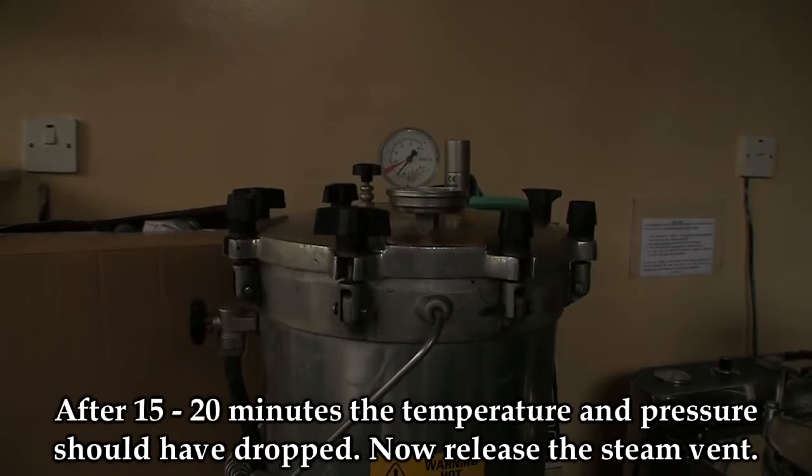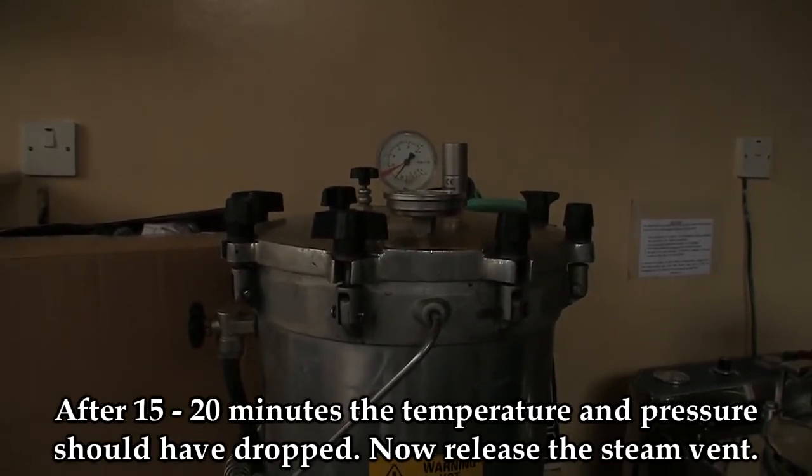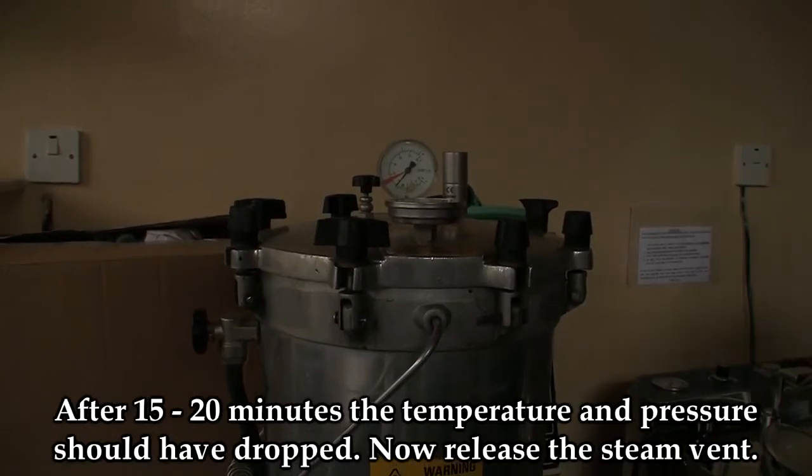After 15 to 20 minutes, the temperature and pressure should have calmed down, so you should release the steam vent.